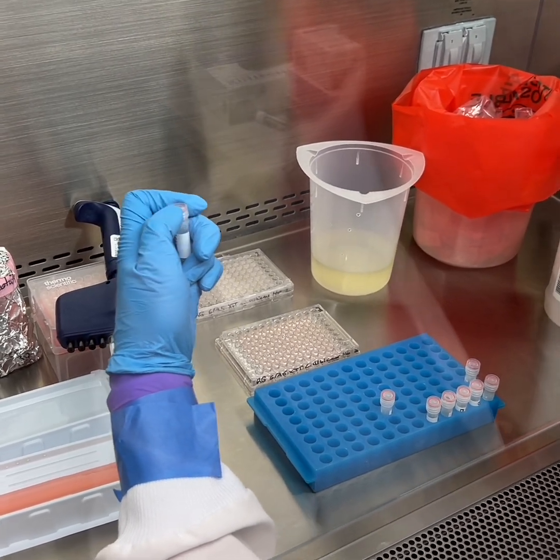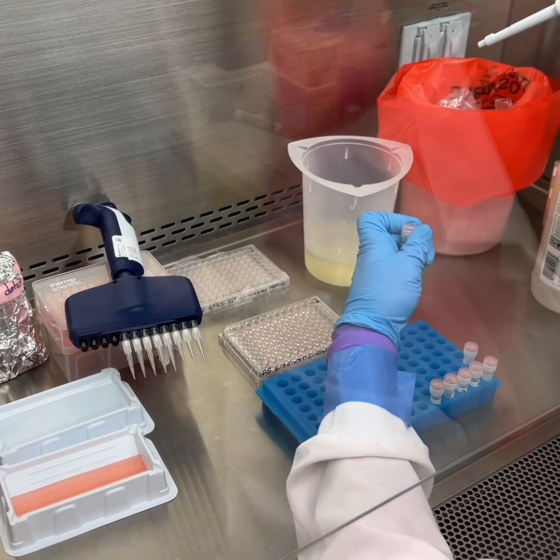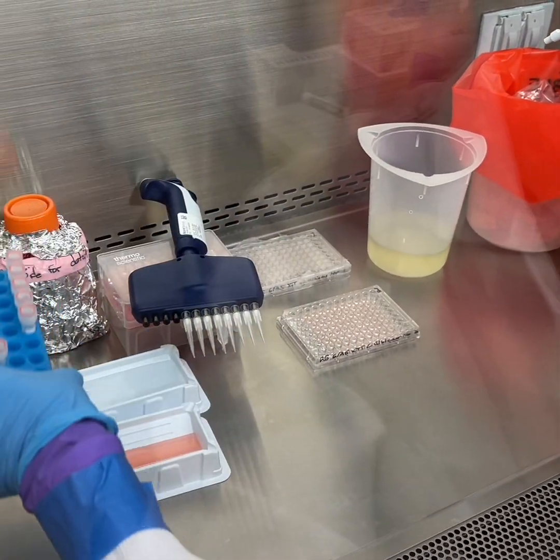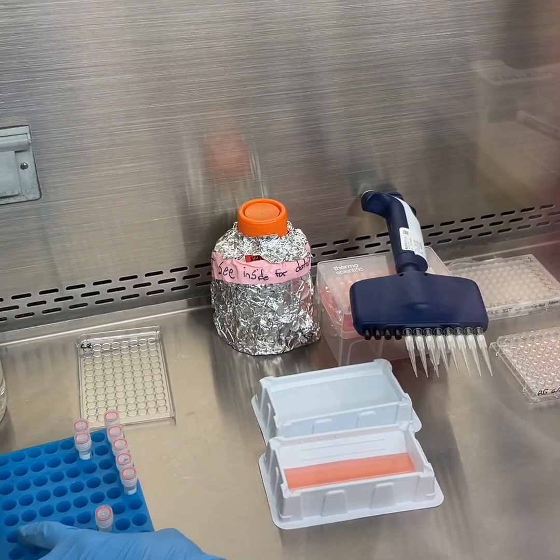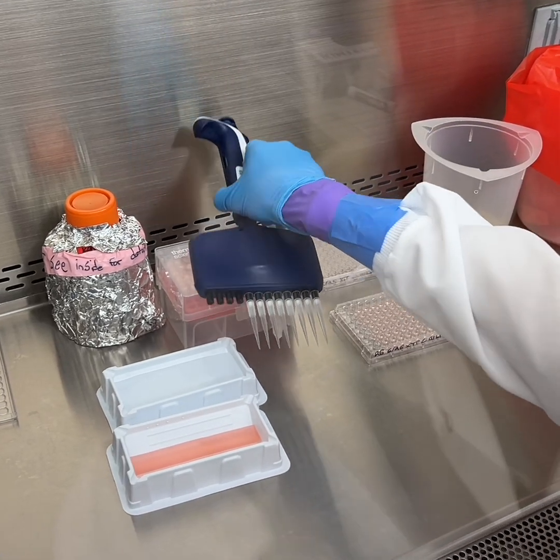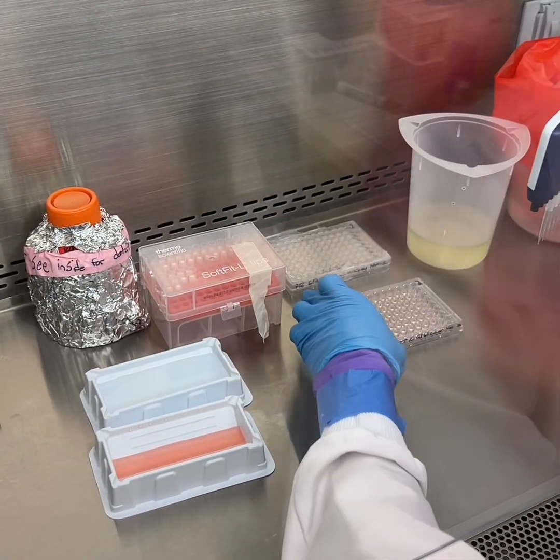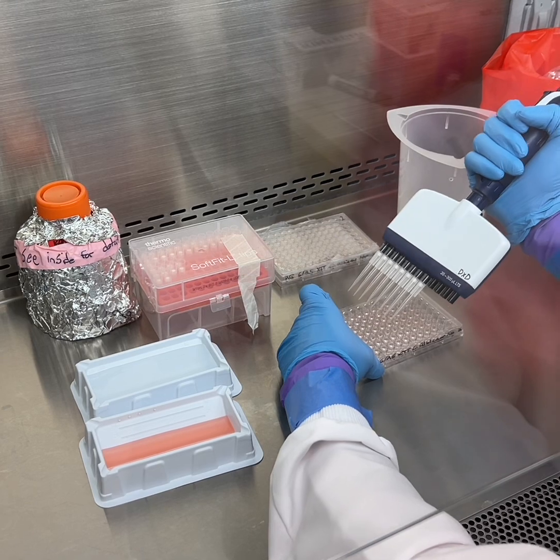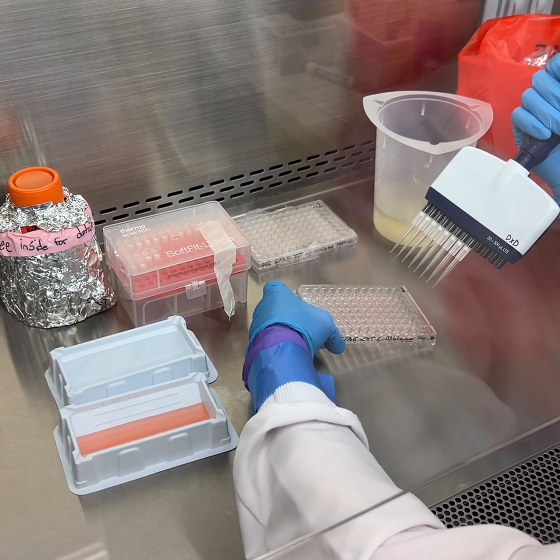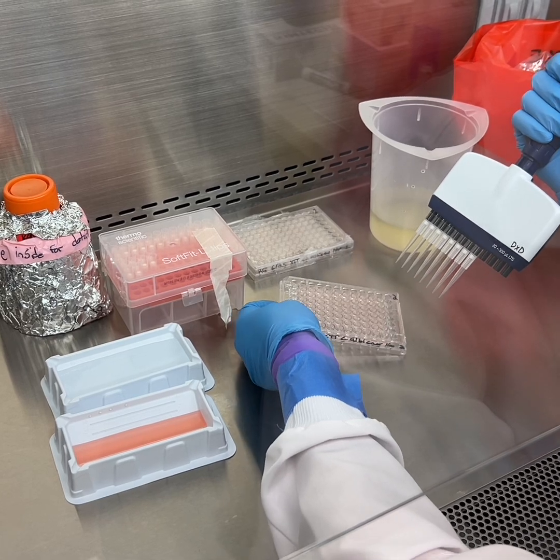Okay, now we are ready to do our serial dilutions. I'm going to set this just out of the way. I'm going to grab this, and it's going to be hard to go this way, just from a visual perspective, the reflection of the glass and the plates and whatever.